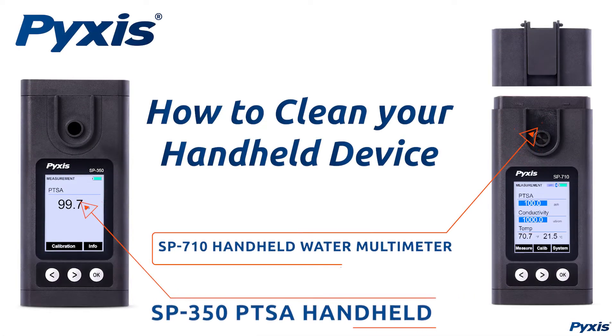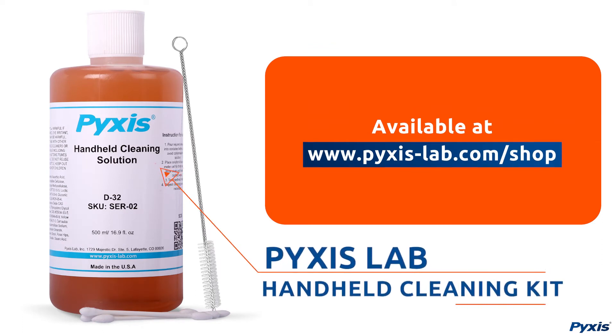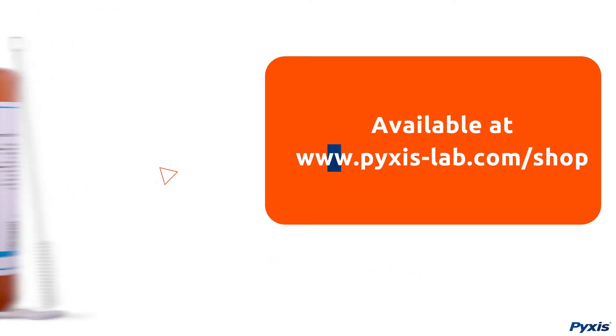This video demonstrates how to clean your Pixis Lab handheld device. To complete this procedure, you will need the Pixis Lab Handheld Cleaning Kit, available at www.pixis-lab.com.